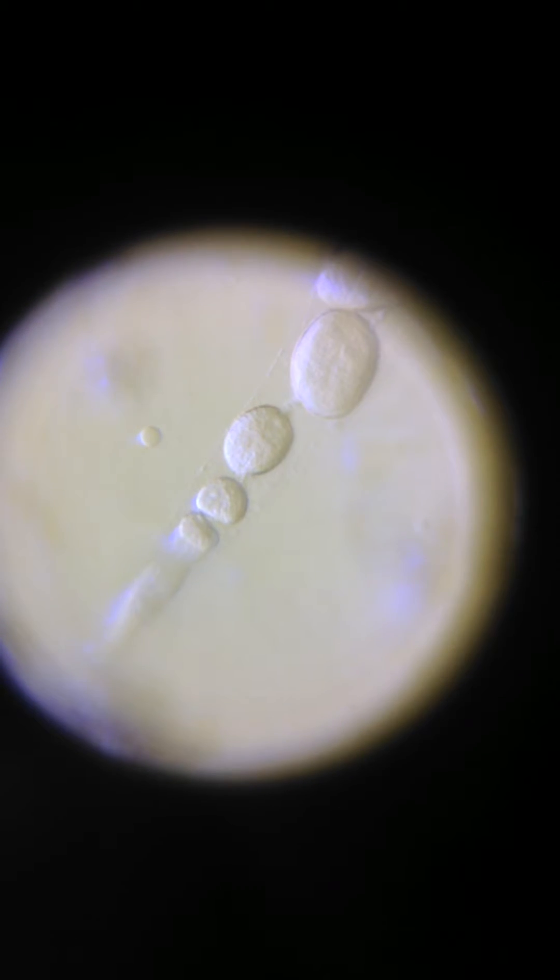That's the string that I was talking about. That's really what gives rise to the stem cells. You see that? It moves. Oh, that is amazing. Right there. They're all attached together, and then they go about.